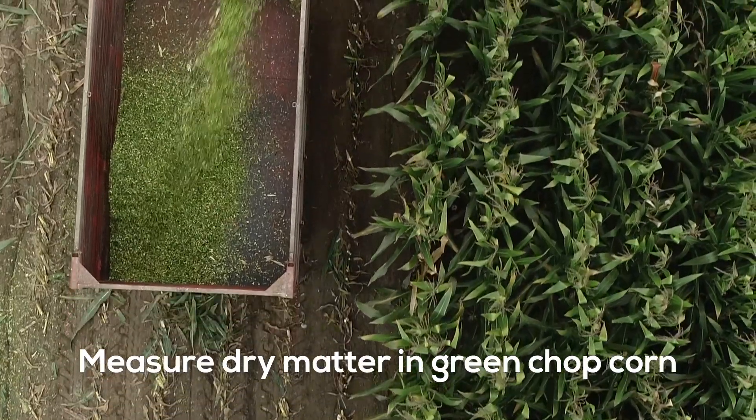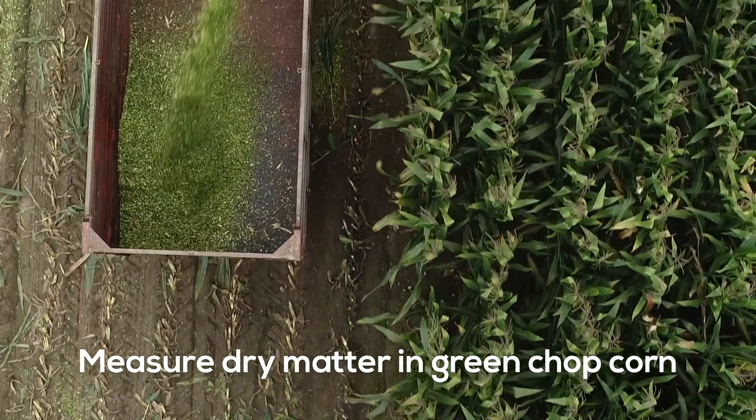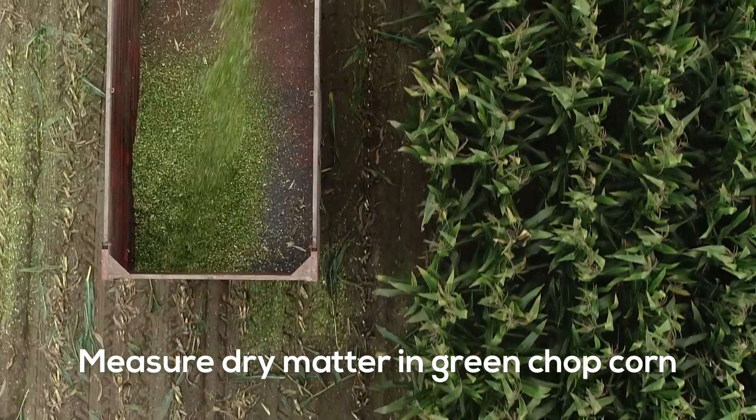It makes decisions easy. With knowledge right at your fingertips, you're empowered to maximize feed efficiency and minimize waste.